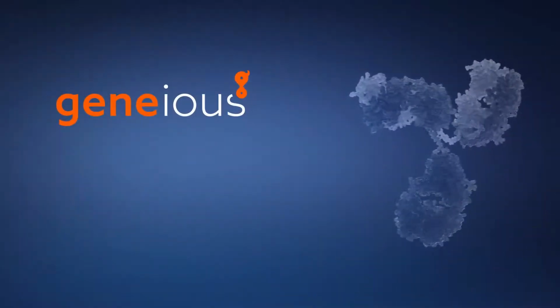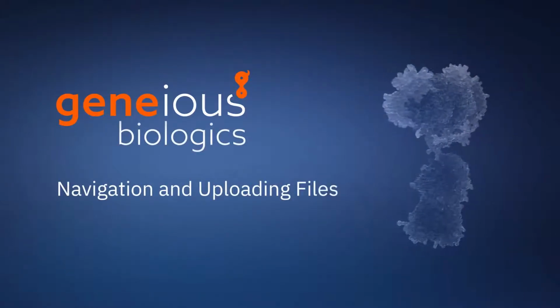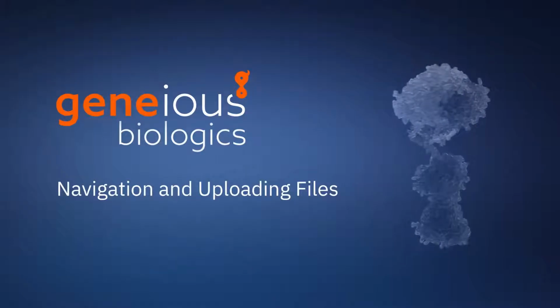Welcome to this Geneious Biologics tutorial video on navigating the platform, uploading data, and making and sharing folders.